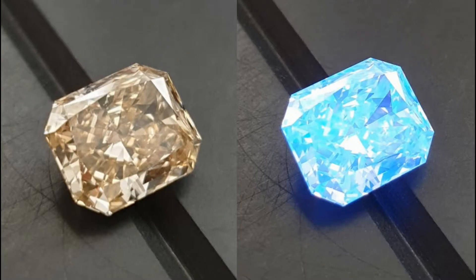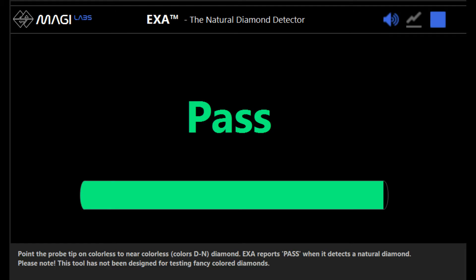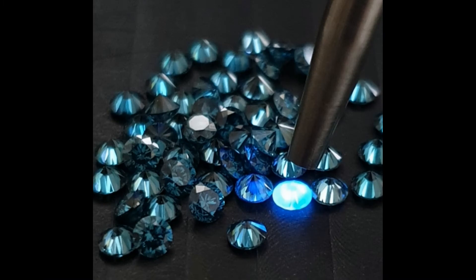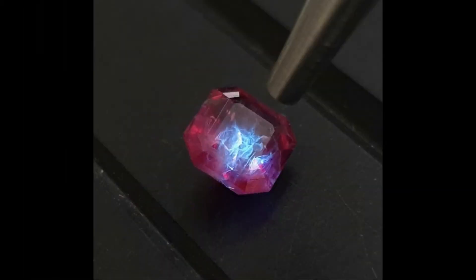The EXA is a fluorescent spectrometer developed for the identification of natural diamonds with applications for color stones. It can be used either for loose and mounted gems.